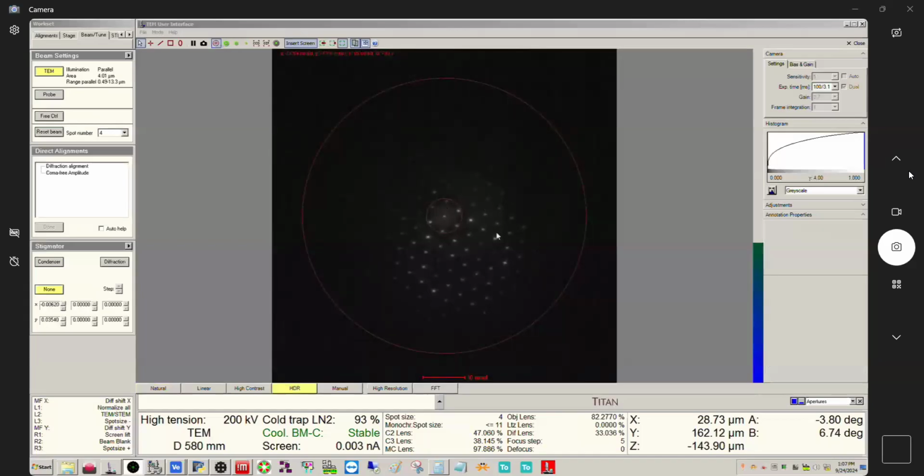Okay, so we can see very clearly we're not close to the zone axis. One thing you can do, if you're careful, is move around with the stage. And because the sample is bent, we may be able to move it as well till it gets close to the zone axis. Again, we want to stay within the grain, obviously. And so, you can't tell if you are now. You're going to have to go based on the appearance of the pattern.